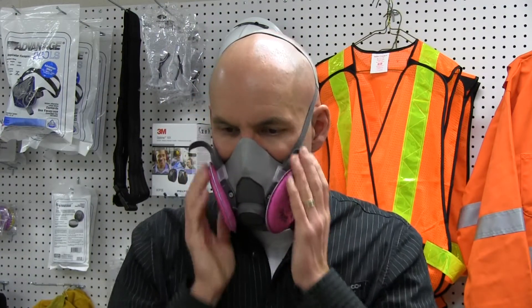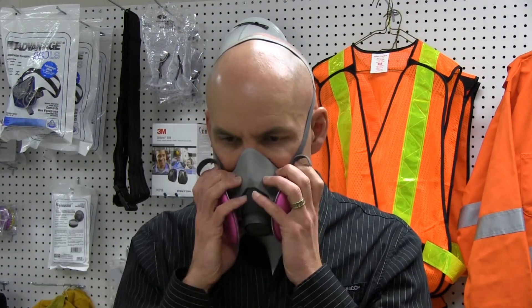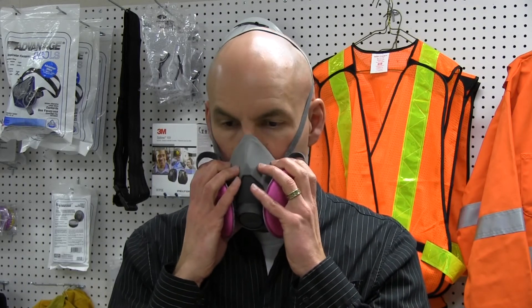If there is a leak, the user should check the inlets and the straps, refit the mask, and then try the pressure test again.